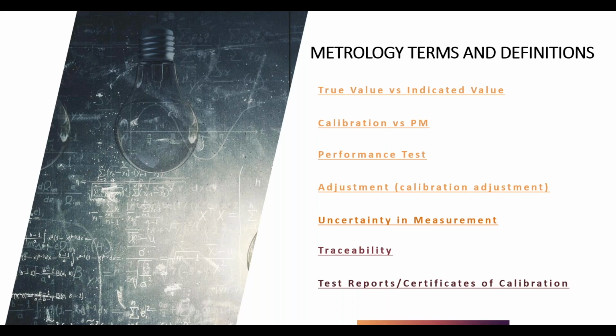So calibration versus a PM. Biomed, you guys use PM all the time. Believe it or not, it's the same thing in our lab. We just call it a calibration. For us, a PM is the filter clean. But when we take the measurements, that's the calibration or the performance test.